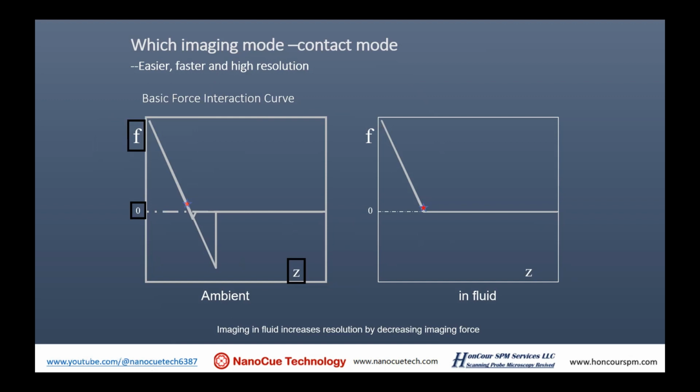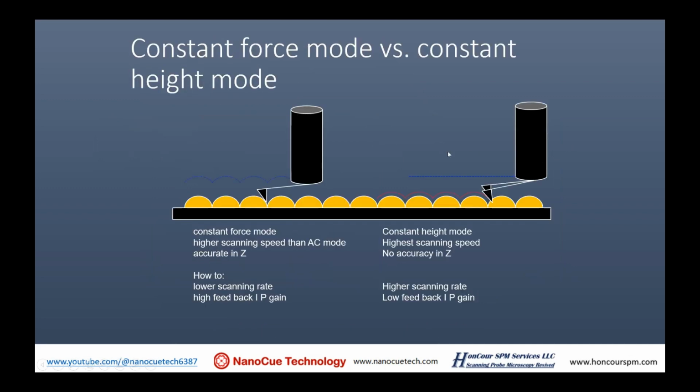Contact mode. Contact mode, how does it work?